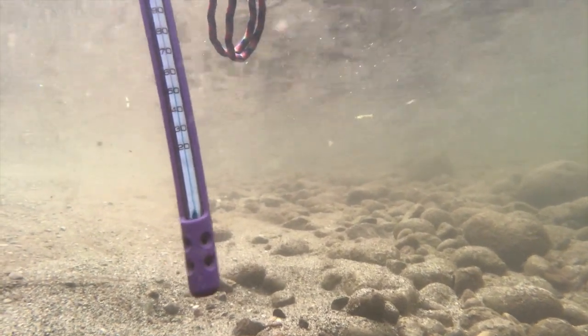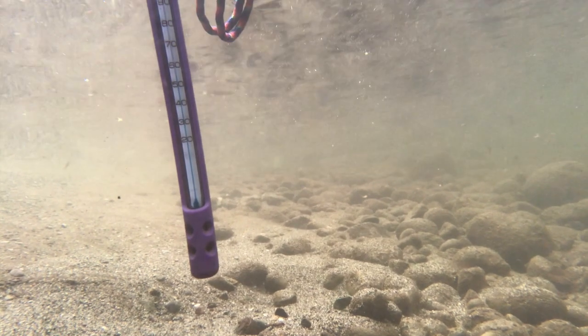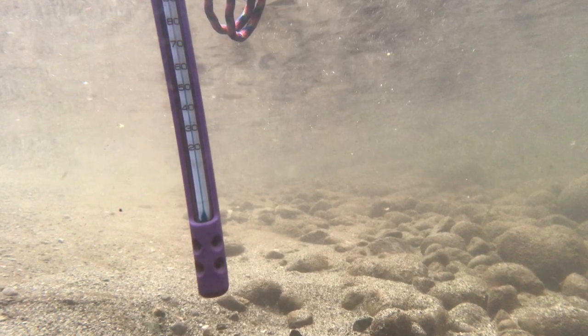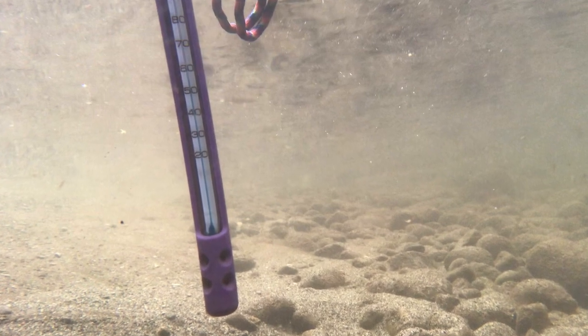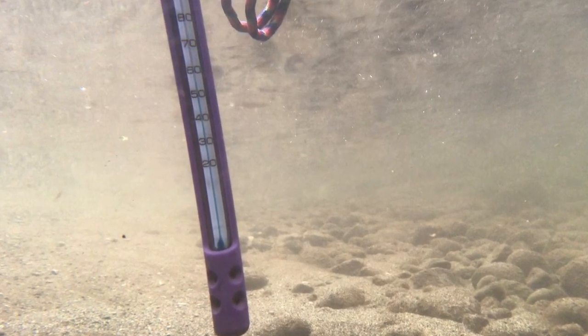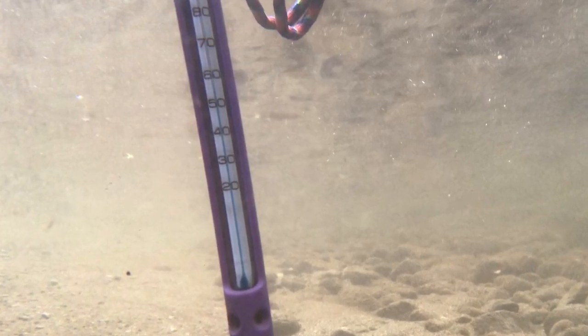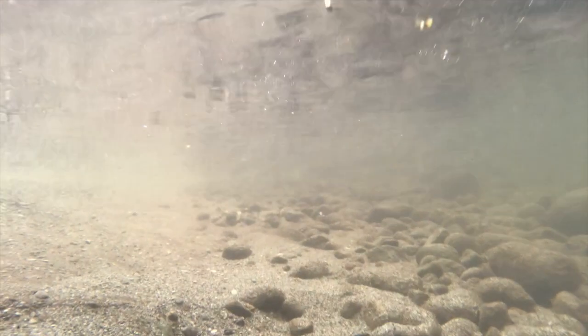Now that our temperature has been stable, we can go ahead and record our results. What does the temperature reading look like to you? To me, it looks like our water temperature is around 54 degrees Fahrenheit. Be sure to write down your findings on your worksheet and circle yes or no for whether we met the Salmon Standard.